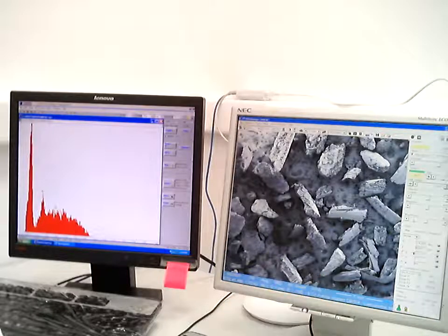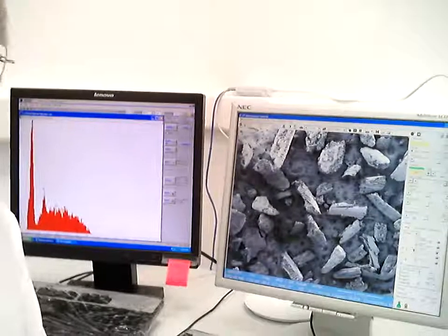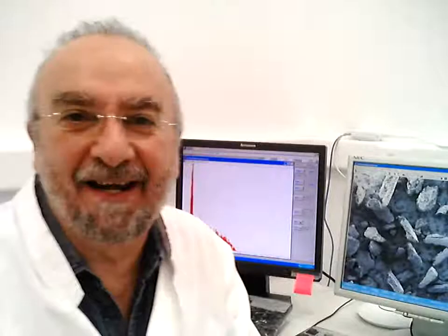Unfortunately, we don't have much time anymore, so I hope you enjoyed it, and you can actually now compare real forensic science with the forensic science they show in Hollywood in the films. So if you want any more information, you're welcome to contact me, and we can talk more about this.